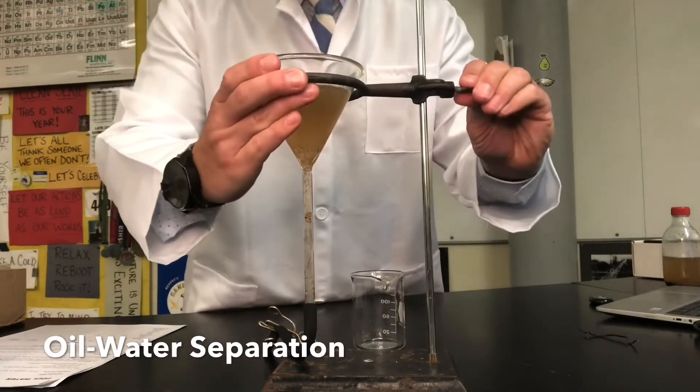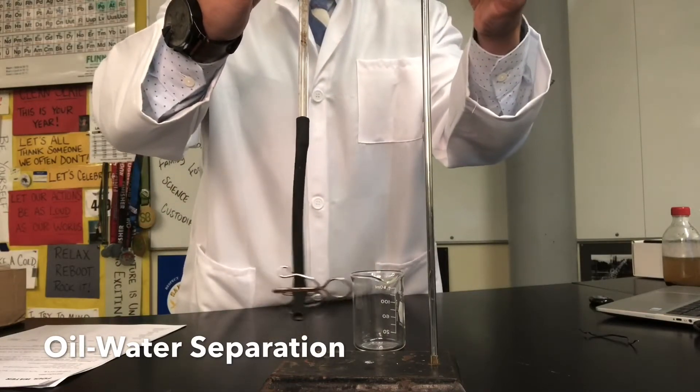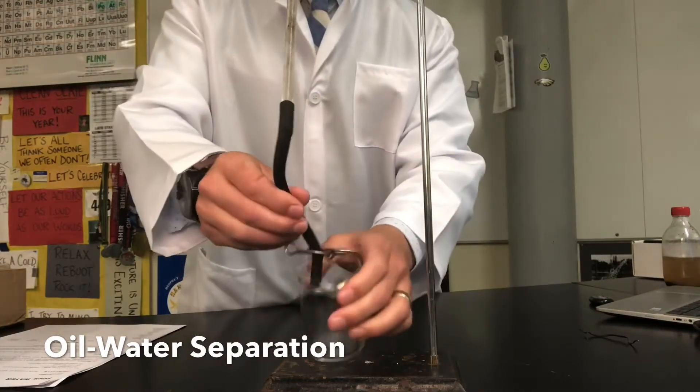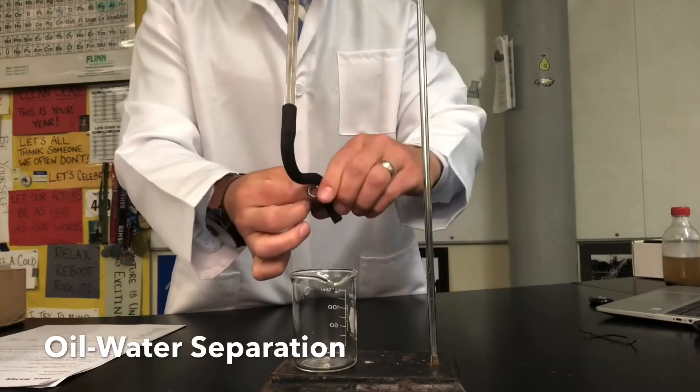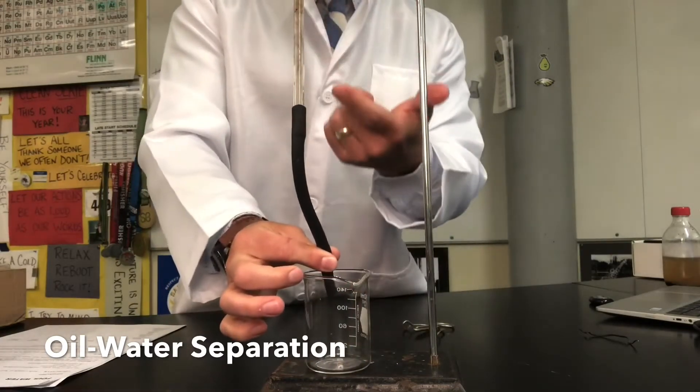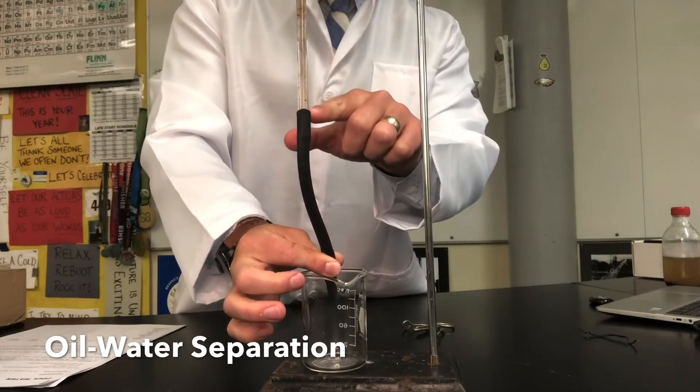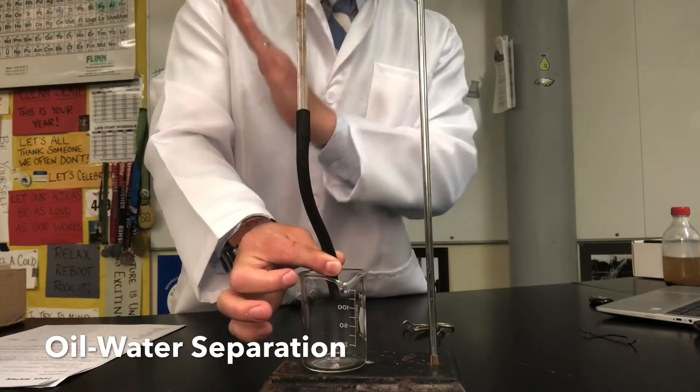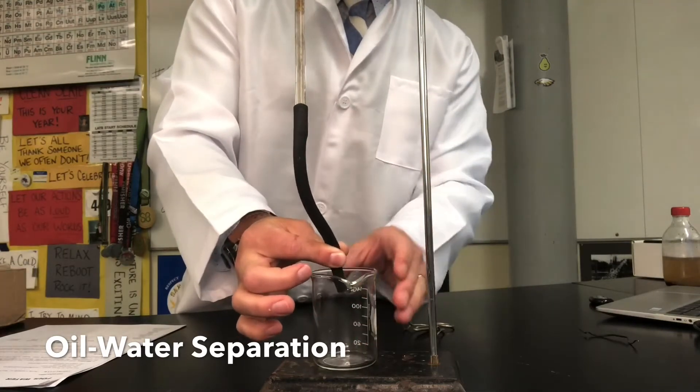So what I'm going to do is I'm going to take my ring stand and raise up my funnel a little bit. I'm then going to put a clean beaker of water underneath here and I'm going to pinch shut and unclamp this. What I'm going to do is slowly let out the water and drain it out but as soon as I get towards the bottom here with the oil I'm going to pinch it shut and separate the oil out. So that's the whole idea of this physical separation.